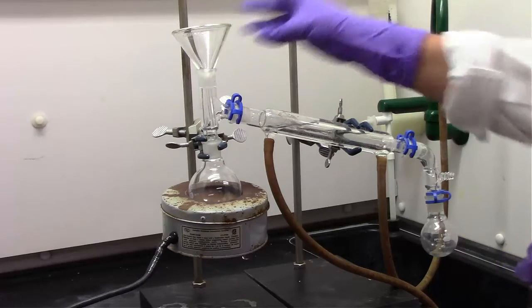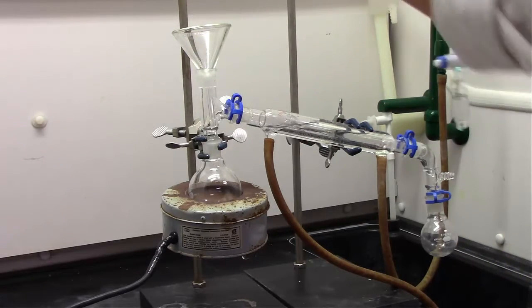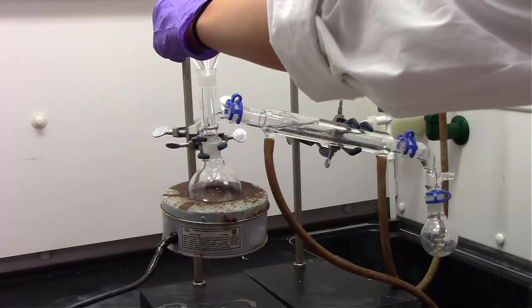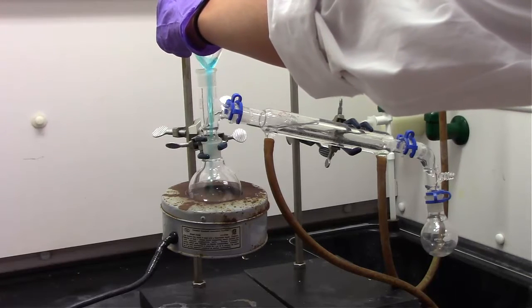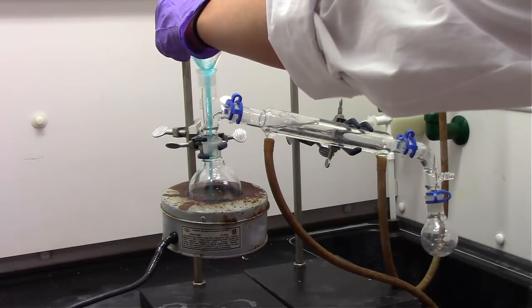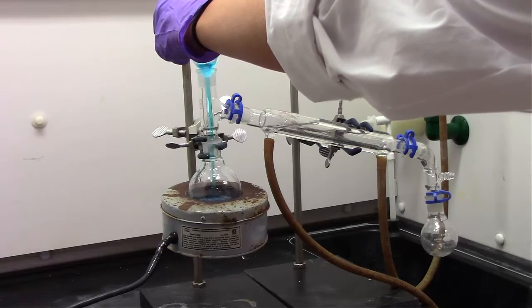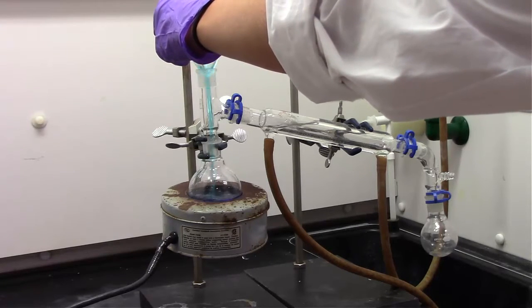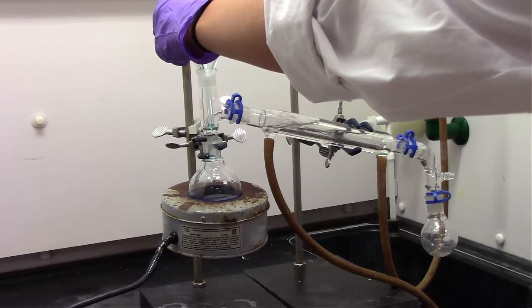We have a simple distillation apparatus set up here, and we've added a funnel to pour in our solution. It would have been nice if we could just separate it in the separatory funnel, but since we can't, we have to do it another way. So we have set up a simple distillation apparatus.